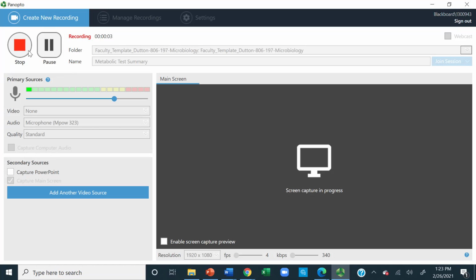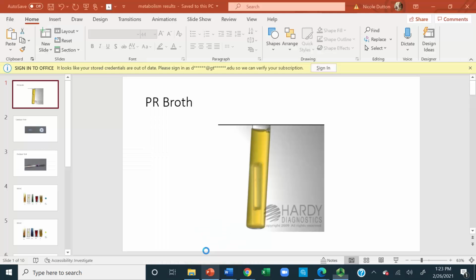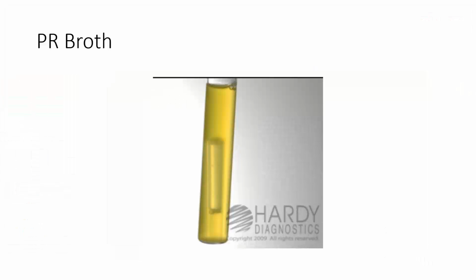In this video, I'm just going to go over some of the common metabolic tests and talk about their results. So here we have the PR broth. If you recall, PR stands for phenol red. Phenol red is a pH indicator that turns yellow in the presence of acid. Acid is typically produced when a microorganism is going to be utilizing the sugar that we put in here.